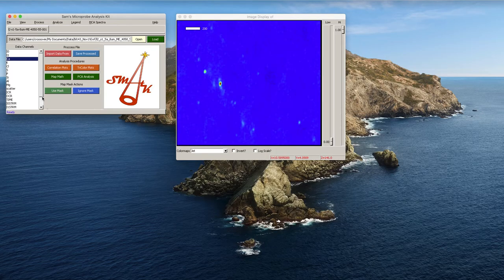So in 2 additional tutorials, we cover blurring. I'll just say here that I like to do blurring before pretty much any of my image analysis steps that I perform because it helps to reduce the impact of noise on the analysis. So these are the 3 images that I come up with.